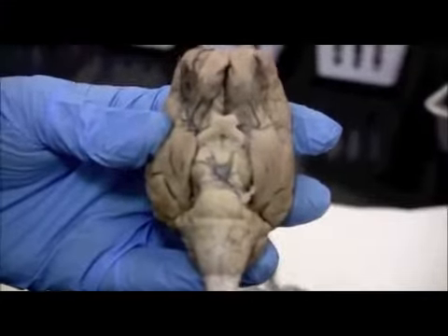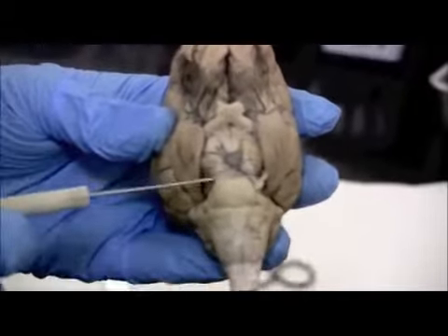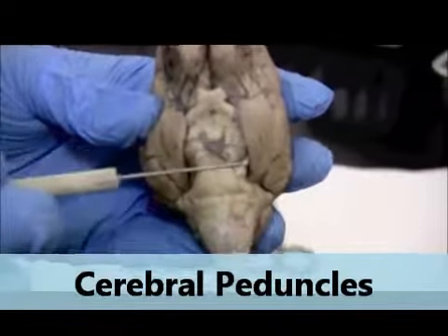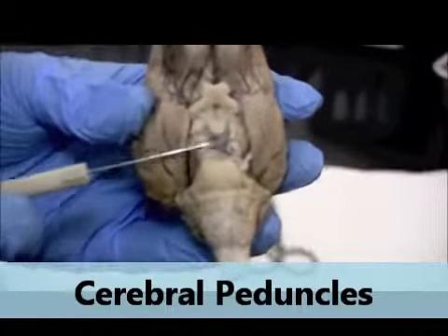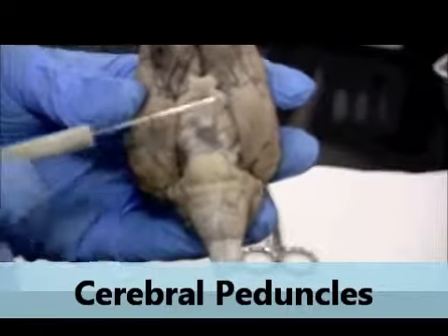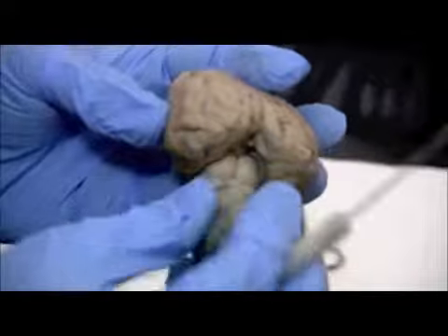Okay, and on the inferior side, the midbrain mesencephalon, just above the pons, you've got these cerebral peduncles. That would be the footpaths that lead from the medulla and pons up to the upper portions of the brain. It's hard to see them the way that you would in a picture, but it's just these regions just above the pons in the middle, corresponding with those colliculi in the back.